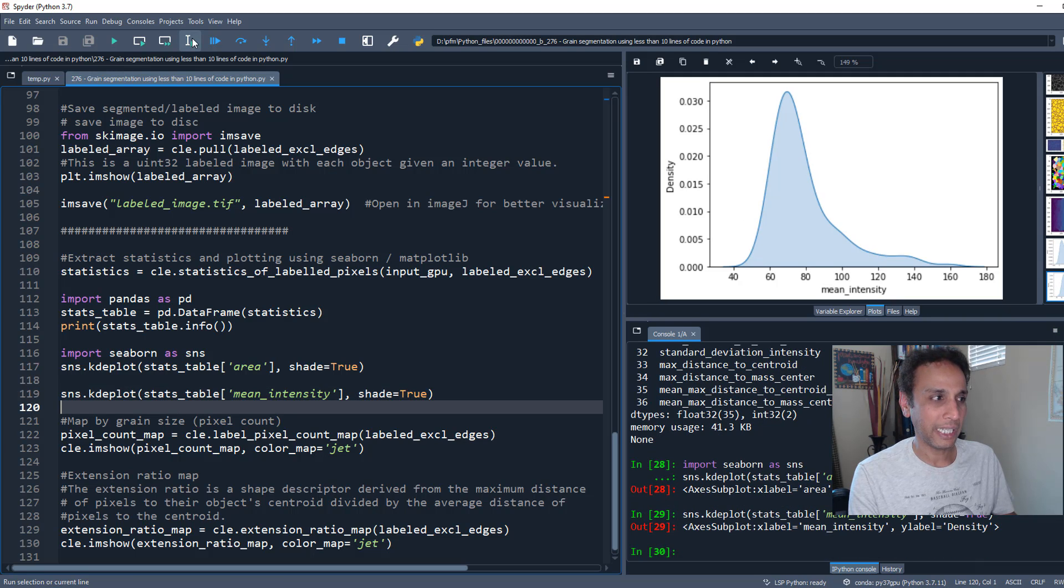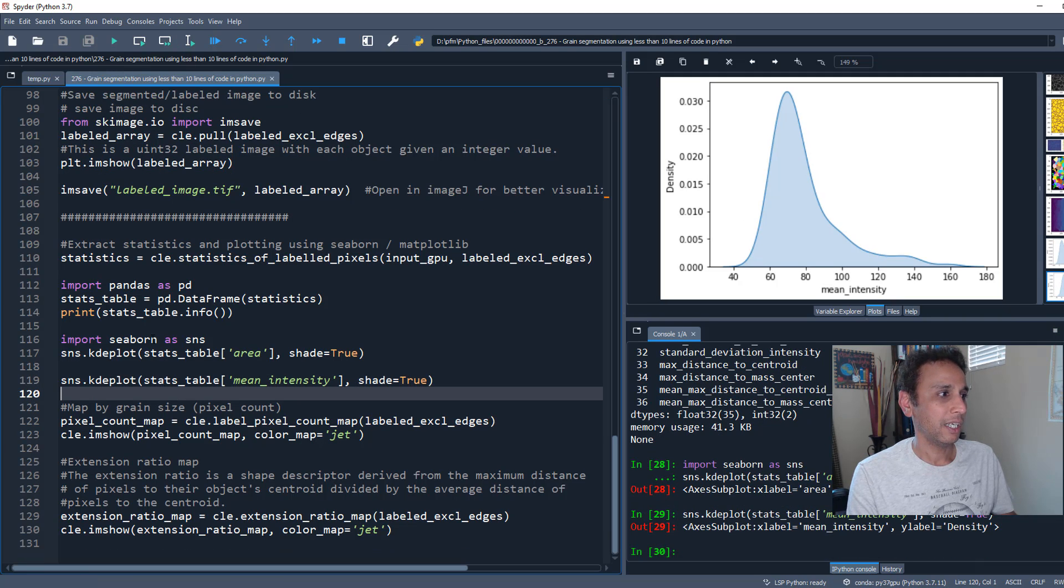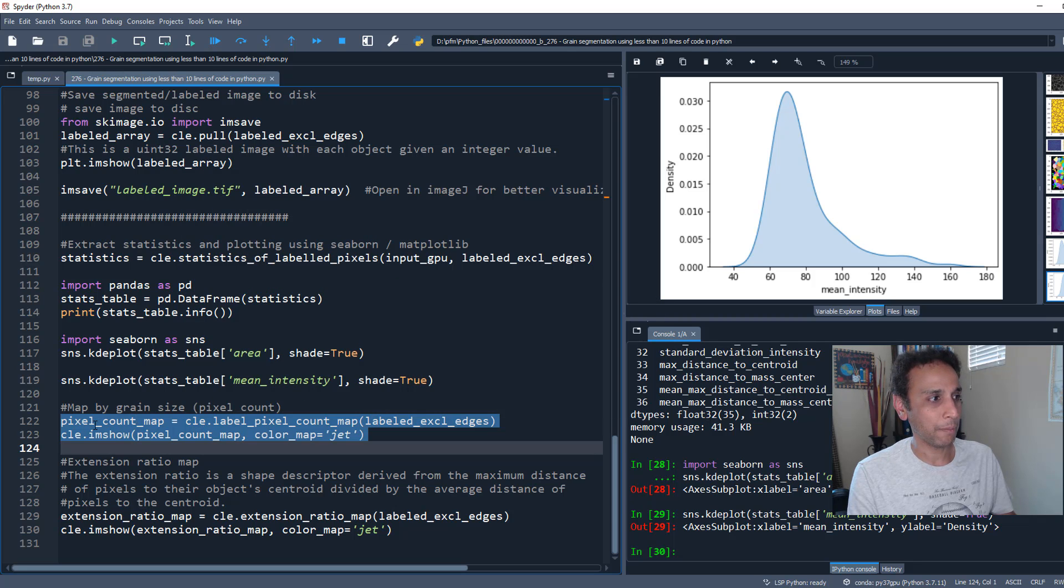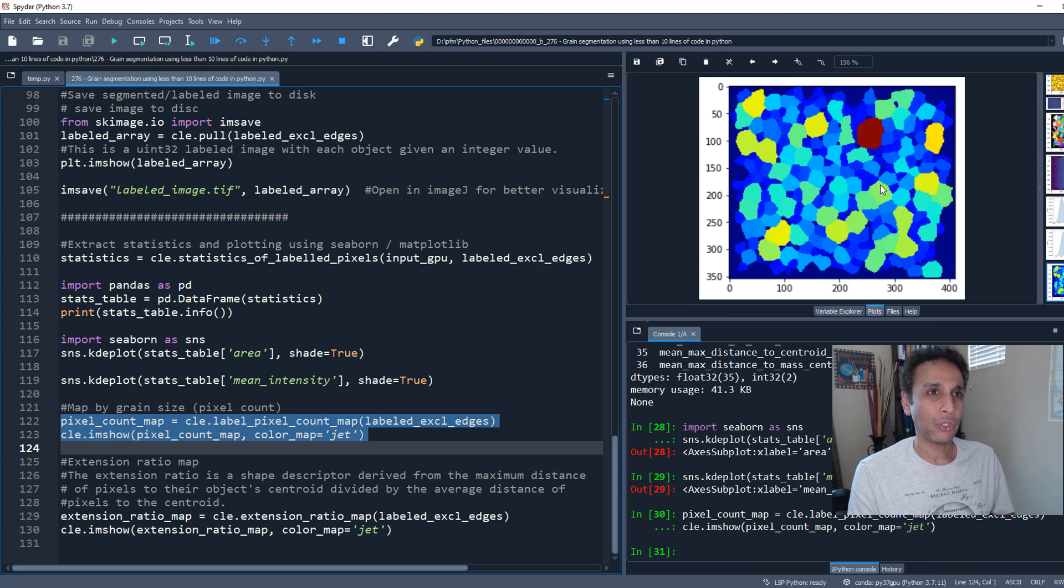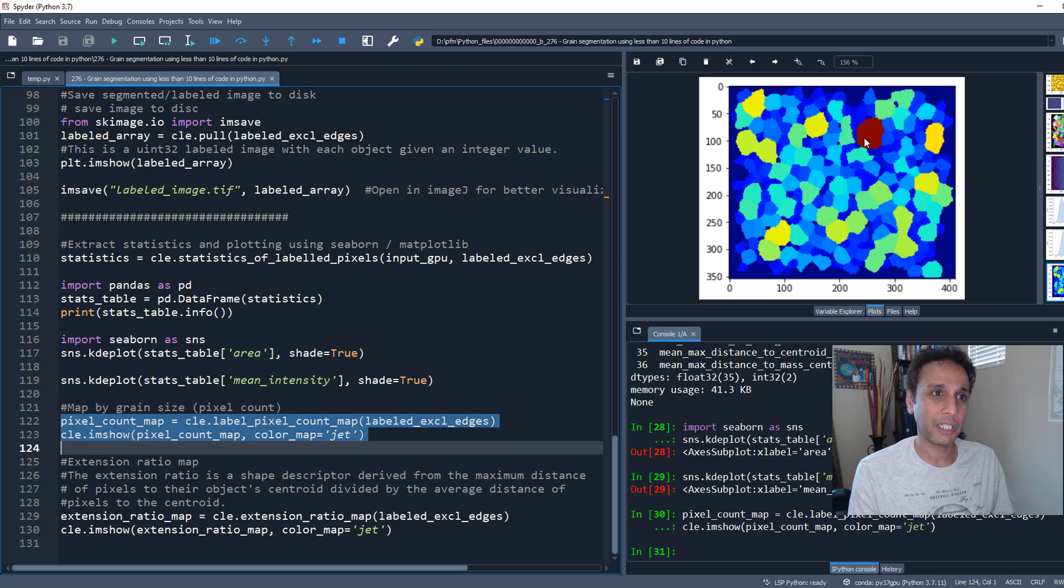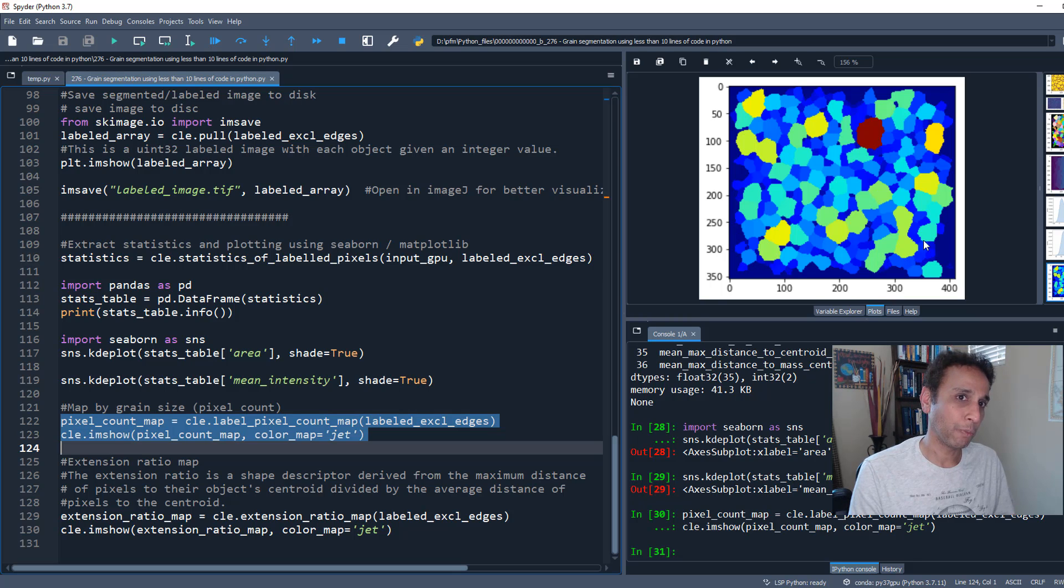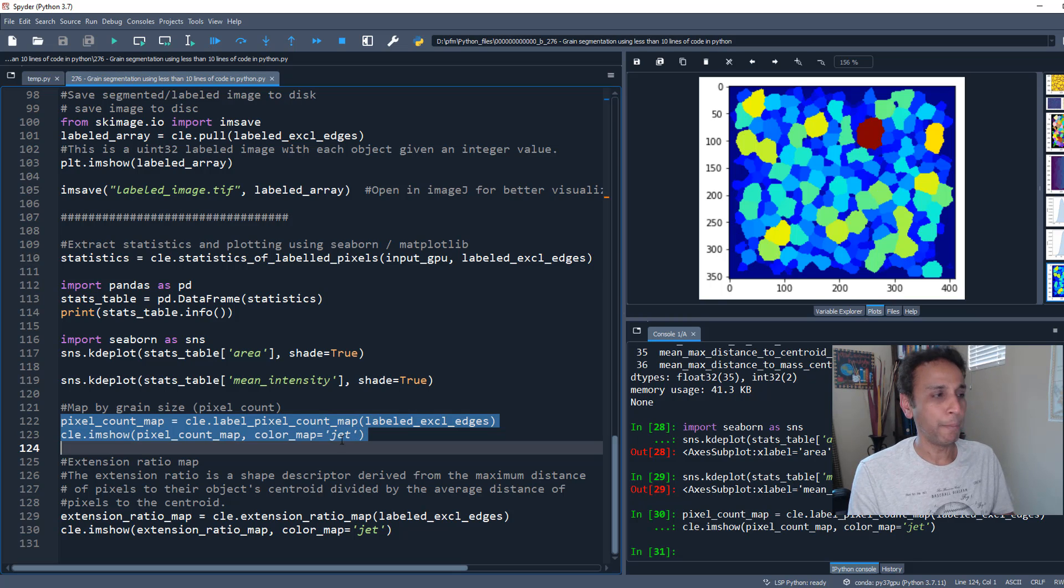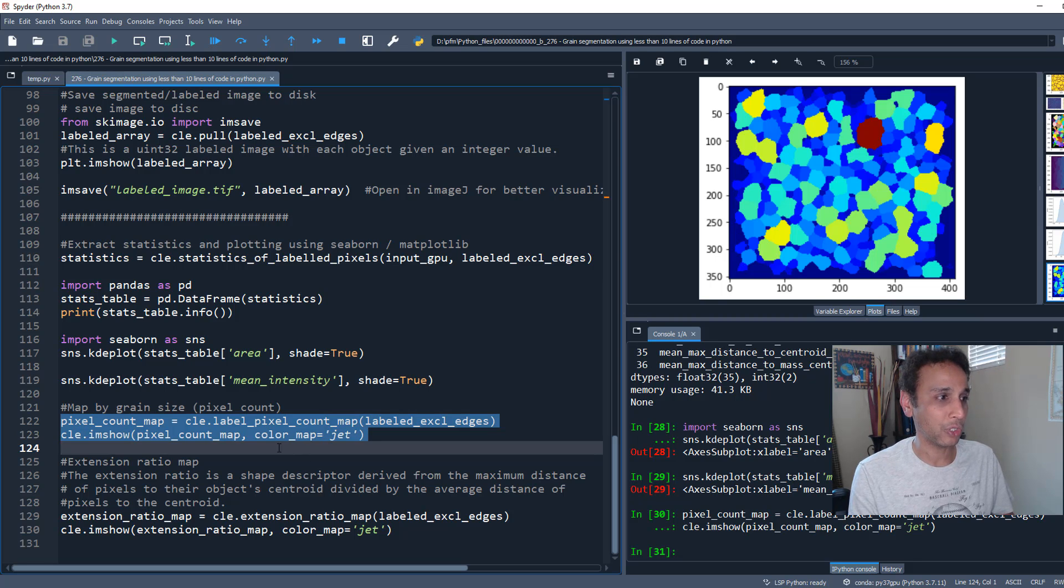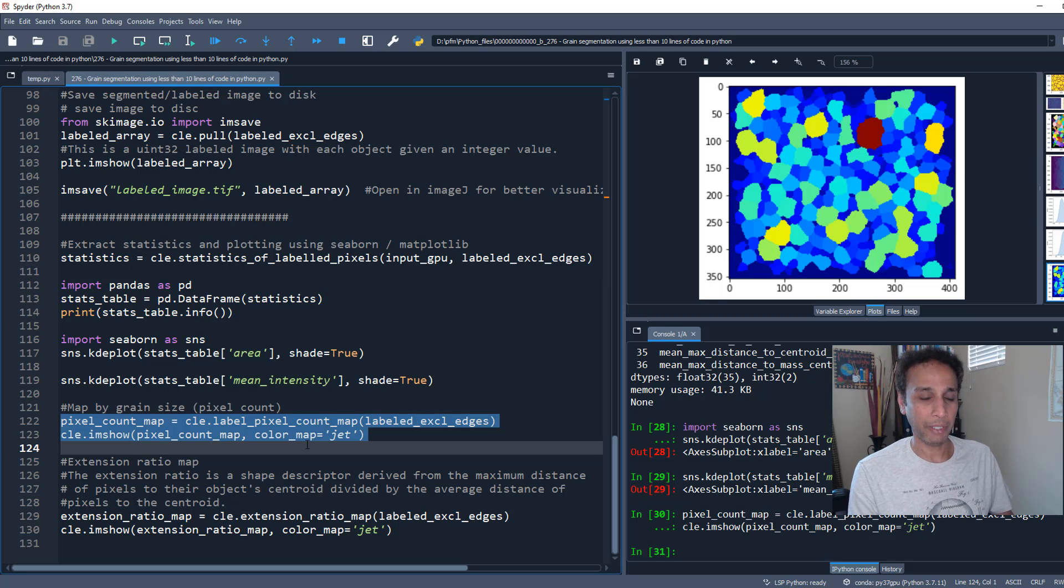You can do built-in plotting from ClassPeranto, like pixel count map. This shows the largest grain - pixel count is how many pixels in an object. These are all very small grains. There are many other examples - go ahead and look at the documentation. They've done an amazing job giving you various examples.